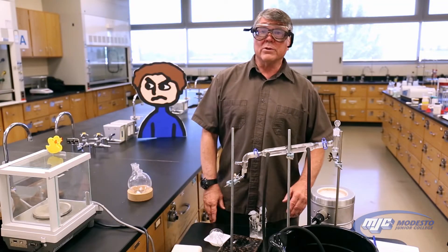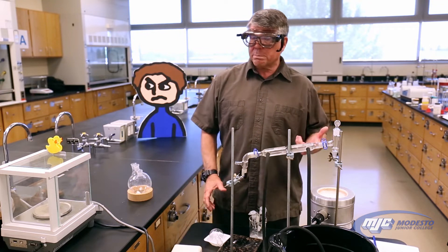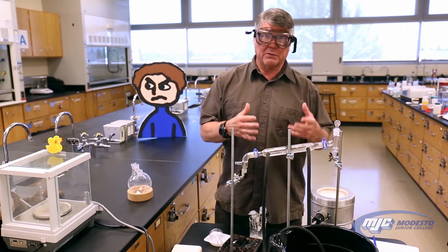Hey guys, Dr. Cadell here. This is the distillation and mass percent sodium chloride experiment. In this experiment, we're going to use a commonly used technique in chemistry to separate mixtures, and that's distillation.